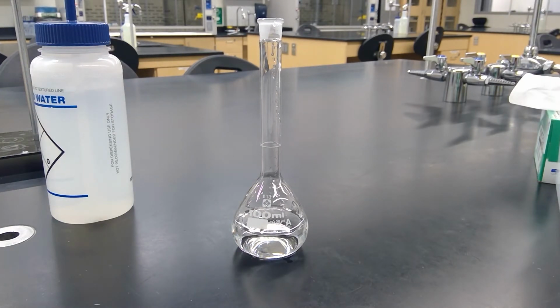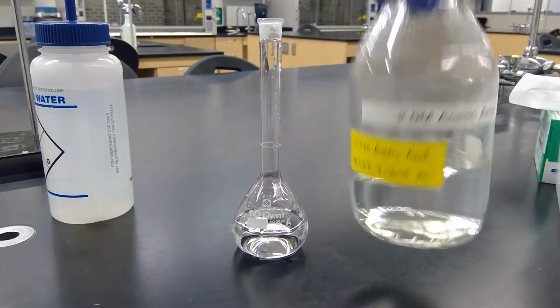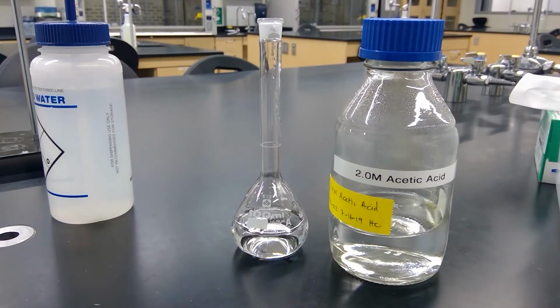Alright, and then it says to prepare the 0.10 molar acetic acid solution. So you'll use the calculations that you did in your pre-lab to determine how much of the stock solution to add. So the stock solution is 2.00 molar acetic acid. And we will want to put it into a secondary container so that we don't contaminate the stock solution.